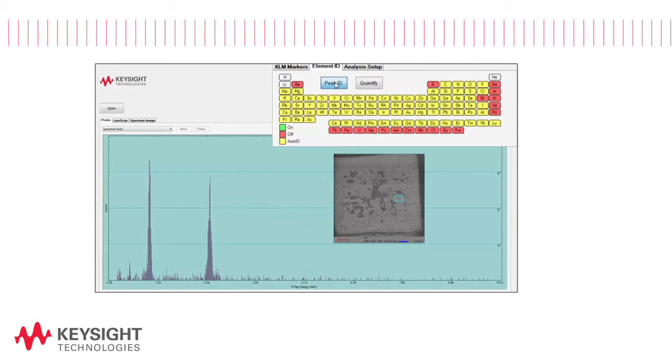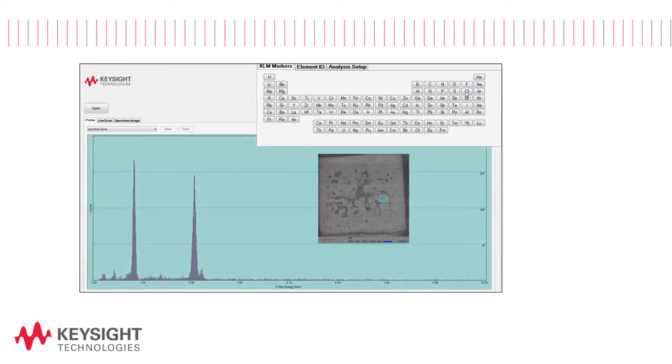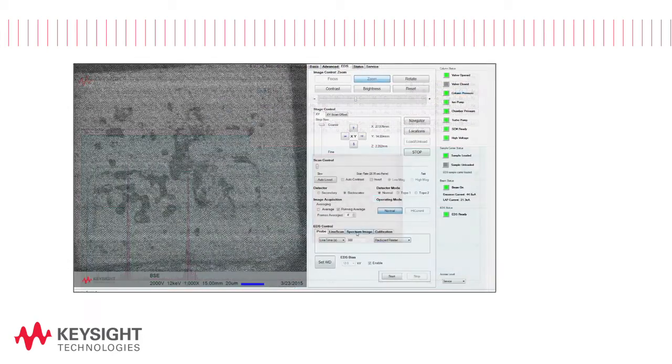You can select standardless quantitative analysis, analysis with standards or a combination of standardless and standardized quantitative analysis.